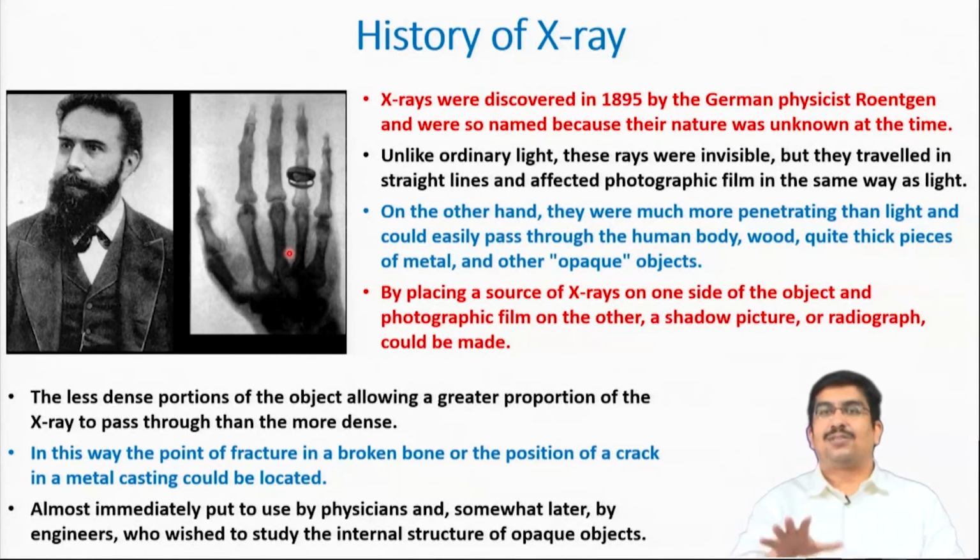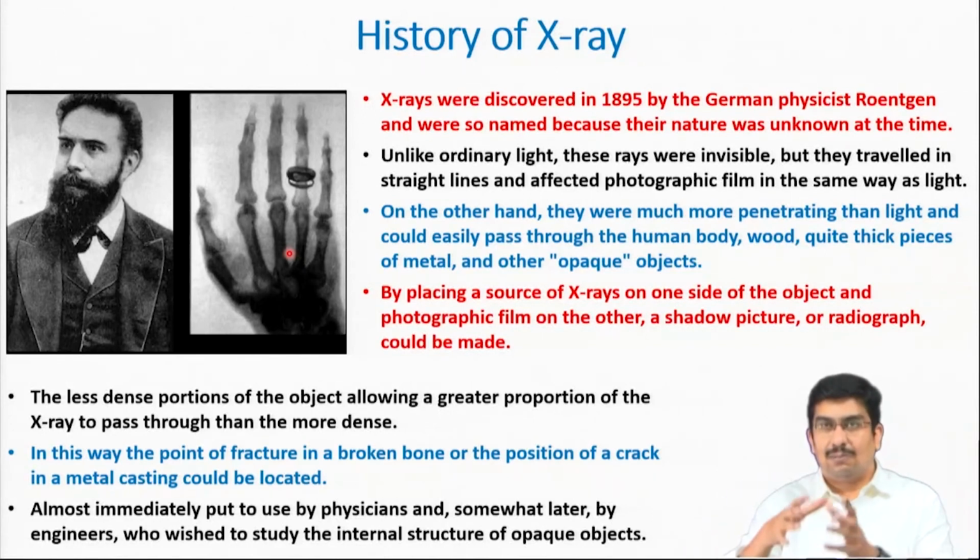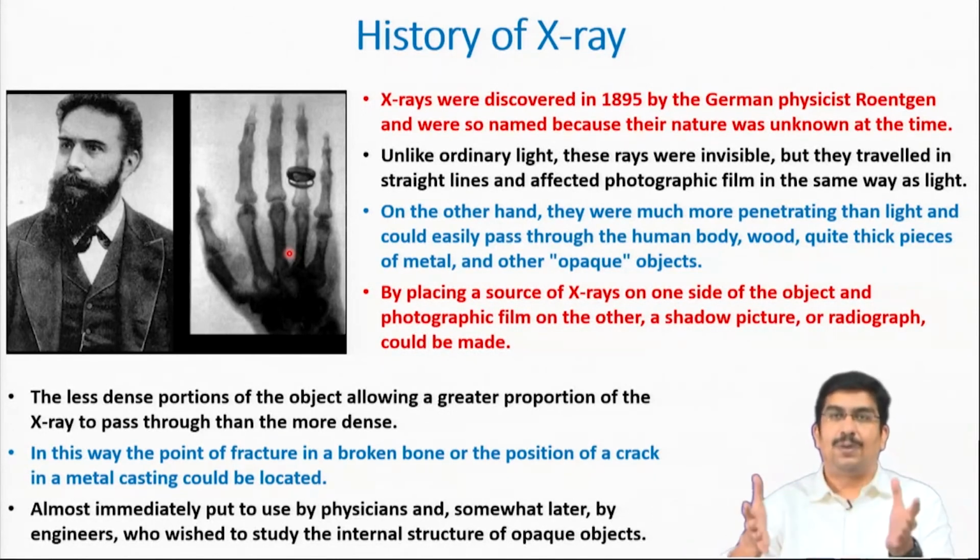So, X-ray plates or X-ray scans, the radiographs, are still used by medical practitioners. Radiographs are still used by people working in industrial practices, people who are casting bigger components, and this is a very popular non-destructive testing of materials, at the component level, to find out cracks, internal cracks and defects in the components.